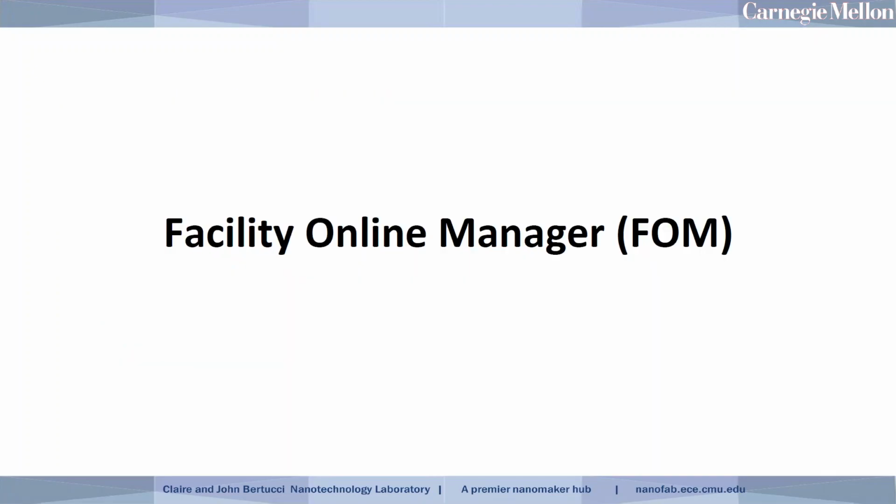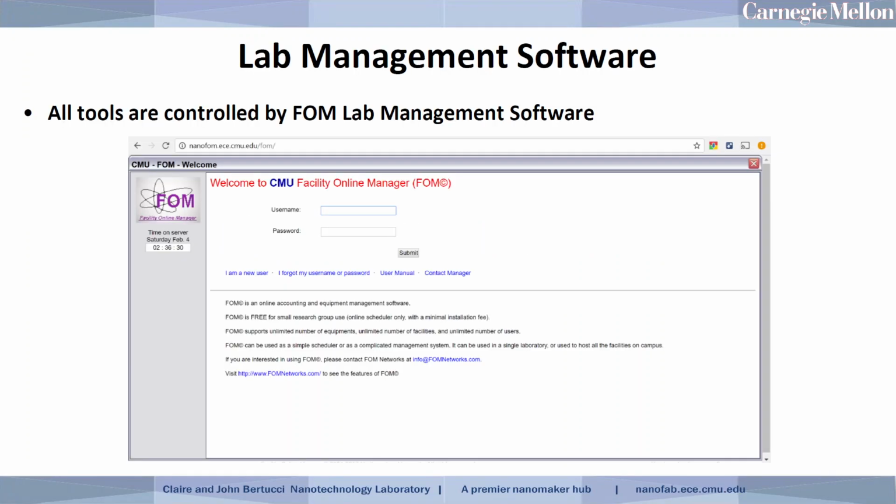Okay, so we're going to switch gears a little bit now and talk about FOM, which stands for Facility Online Manager. In your introductory email, you should have been sent instructions for how to access FOM. So all of what I'm going to show today assumes that you've already set up your account and have access. FOM, the software, is a package that we purchased from outside the university that is hosted on CMU's campus, and it's used to control tool access in the lab.